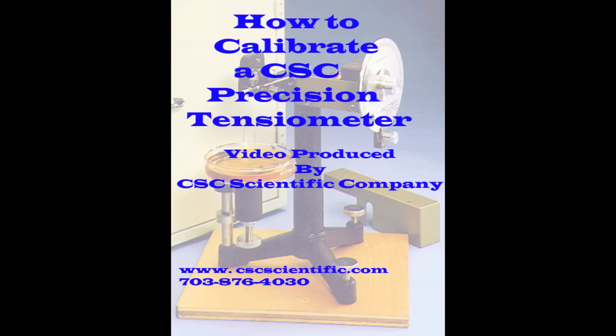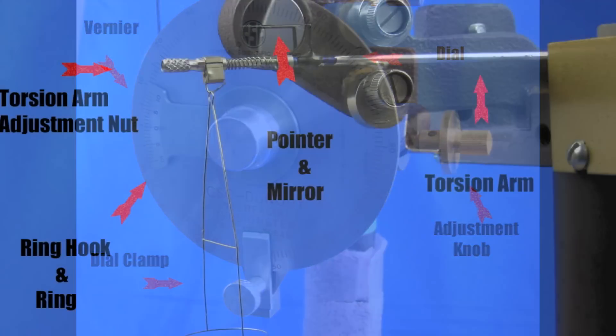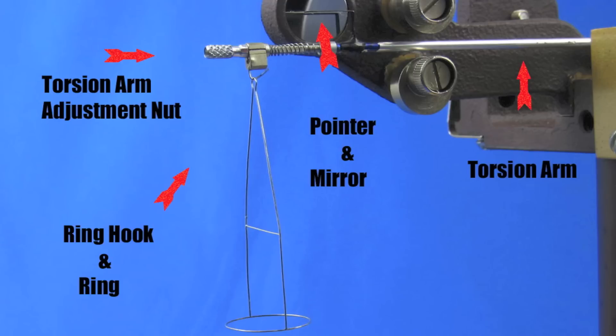Our first task is to identify the key components of the tensiometer. They are, as indicated by the arrows: the dial clamp, the adjustment knob, the vernier, the torsion arm, the mirror line and arm pointer, the ring hook and the ring, and the torsion arm adjustment nut. You start the process by attaching the ring to the ring hook. This will move the torsion arm down to the stop.